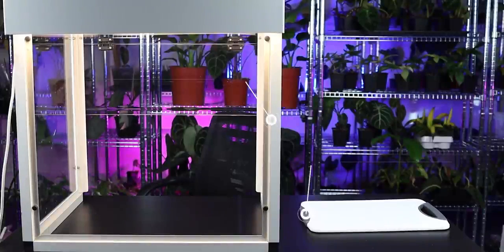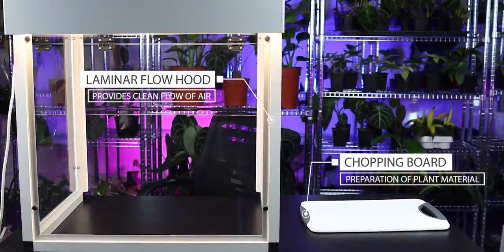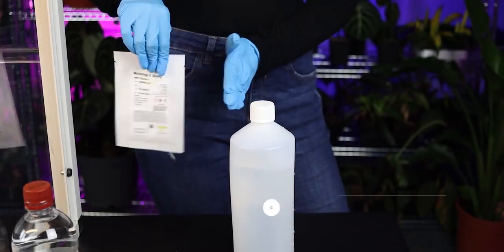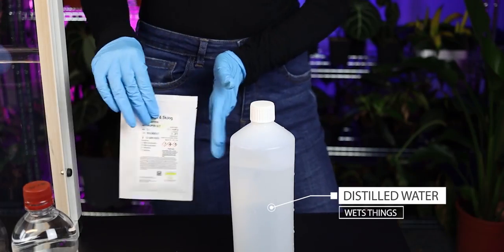As I mentioned before, in this demonstration, I'm using a laminar flow hood. These are used in laboratories to produce a clean flow of air that passes over the medium inside and keeps it free from any airborne contaminants such as spores and bacteria. The first thing we need to do is prepare the growth medium.